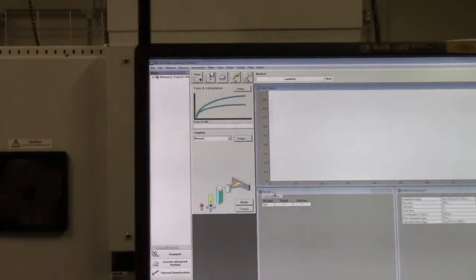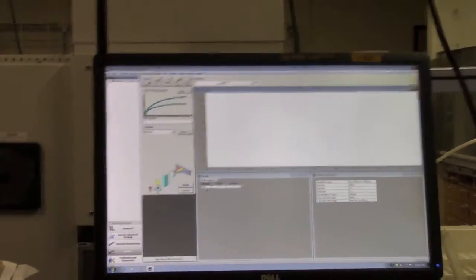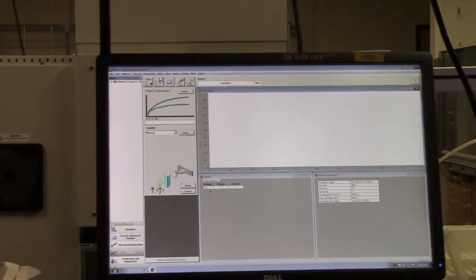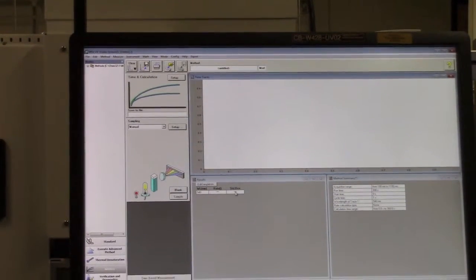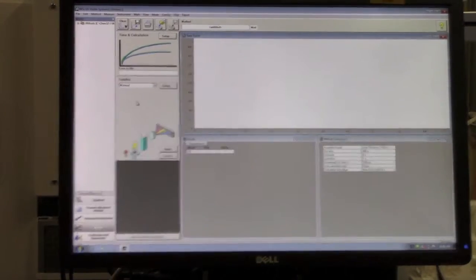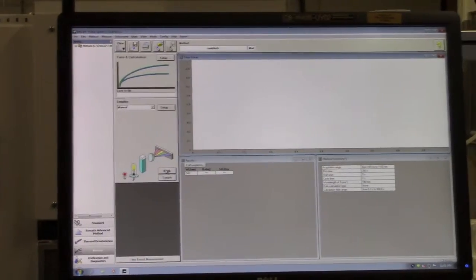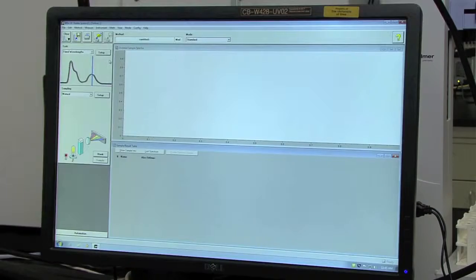Notice in the results section that the wavelength is set to 540 nanometers. There will also be a rate and standard deviation column. At this point, you're set to take the blank spectrum, which you can go ahead and do if you haven't already.